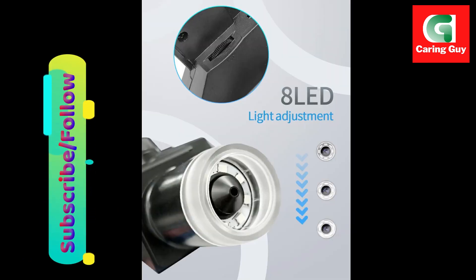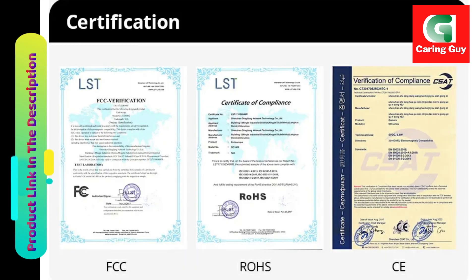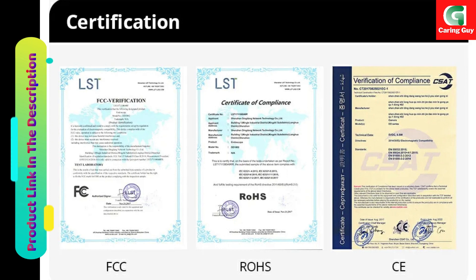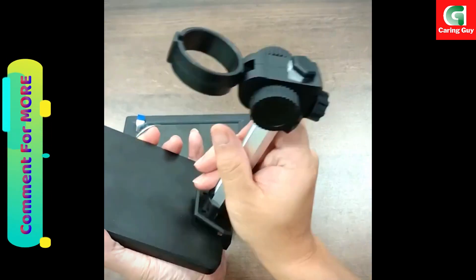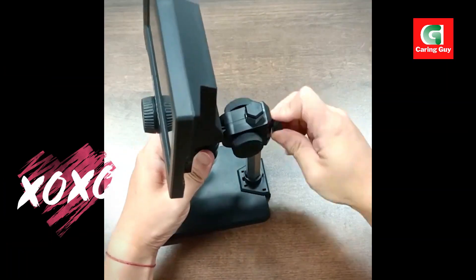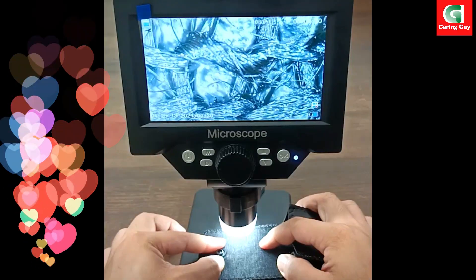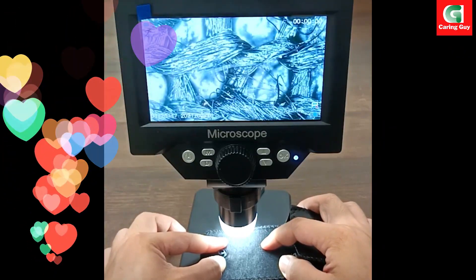FHD 1080p image and video: the microscope features a premium camera chip that supports FHD 1080p image and video capture. The precision fine and coarse focusing mechanisms ensure quick and sharp specimen focus, providing users with high-quality visuals for their observations.